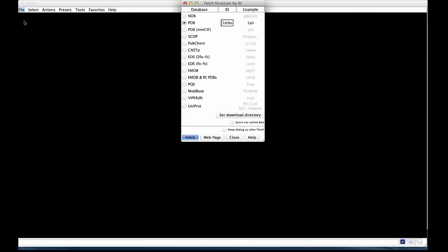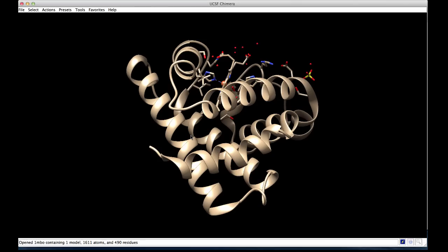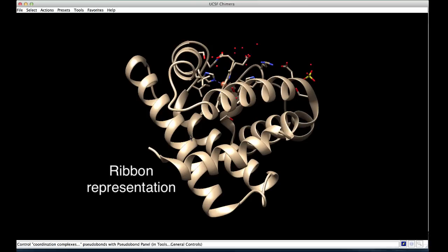For example, if I click on fetch and type in the PDB identifier 1MBO, Chimera can fetch the coordinates and display the molecule. Notice that the protein is represented in the ribbon representation, whereas the ligands and some specific residues are shown in a stick representation.